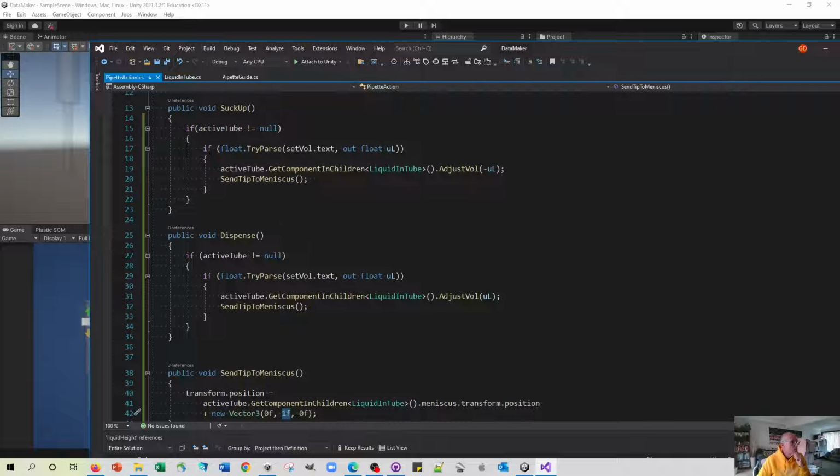And then the other thing we need to check is that there's a parsable number in the input field. Now, it would be better in the long run to allow the user to type in something like 160 UL or 160 space UL or something like that, and parse out the number part. But for the time being, I'm just saying, unless you can find a float or something that can be turned into a float in there, don't go to the next step.